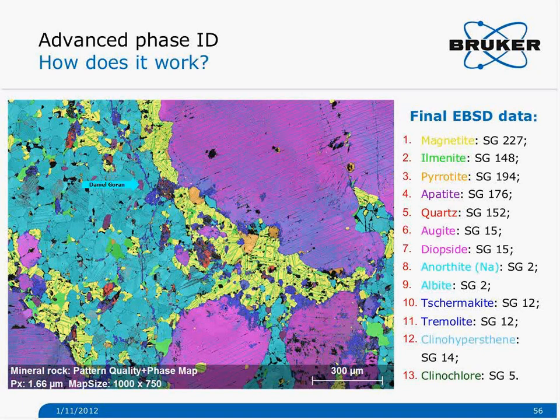And that's very true, especially when you do EBSD at 20 kV on silicates in this particular case. So that, in principle, would be a big issue, and would decrease the resolution of particles you could identify using this method.